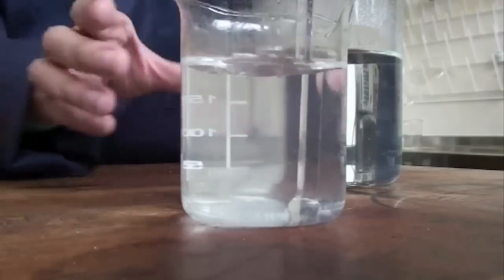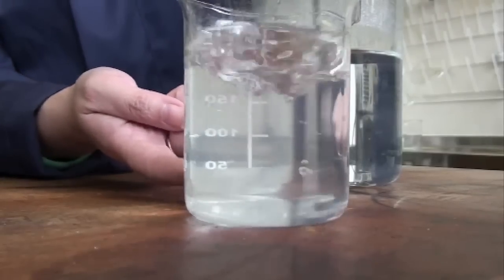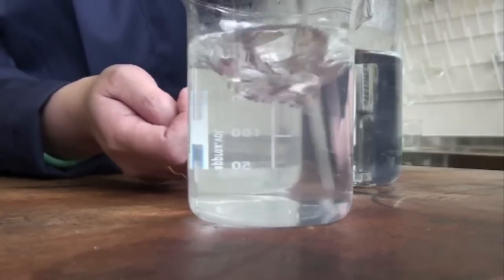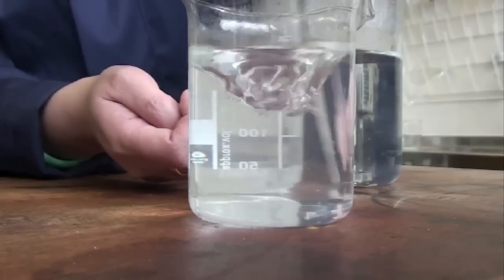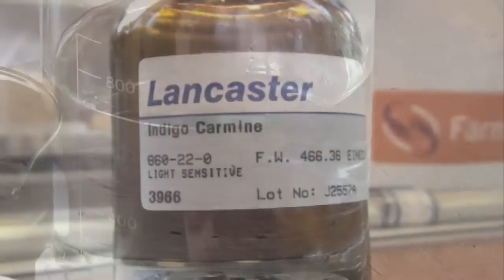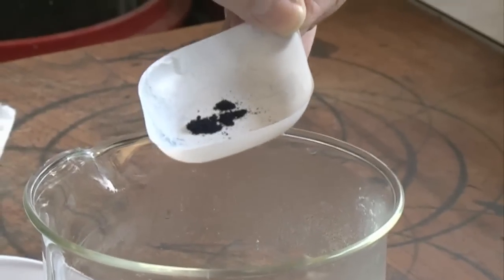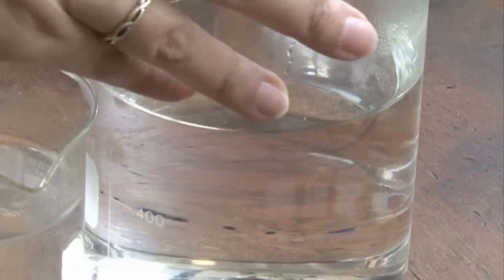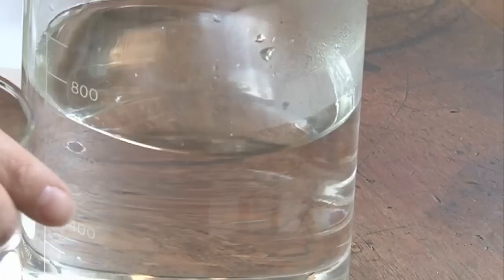We've got our sodium hydroxide, we've got our glucose solution. Both solutions are colorless, they're clear, quite dull. With the addition of this dye we'll be able to see a color change reaction. If you look at it in this container it's really dark, it almost looks black, but once we add it to this you'll actually see what color it is. In it goes.